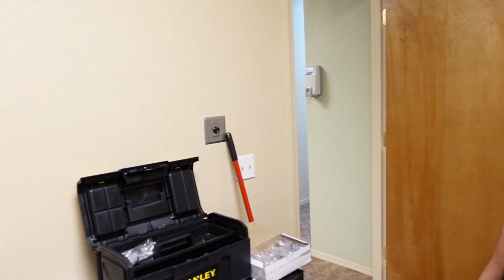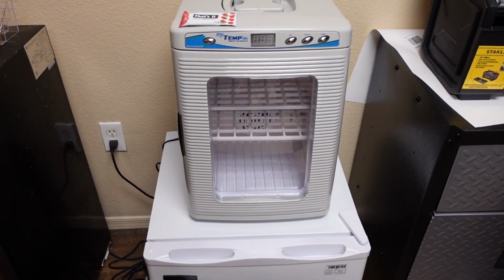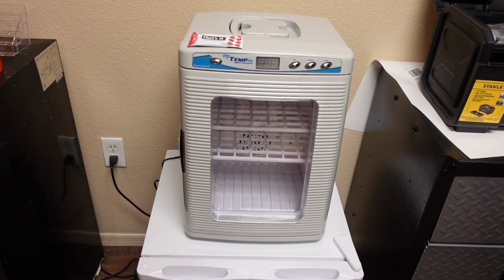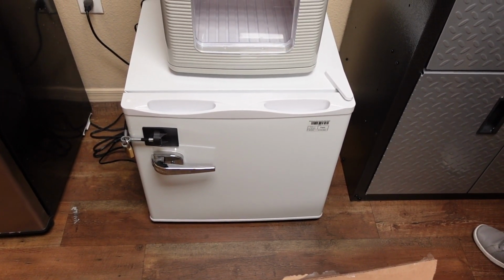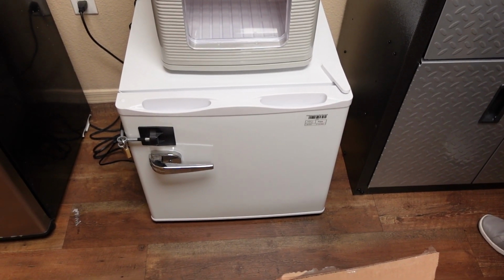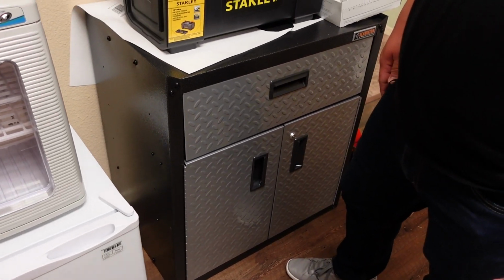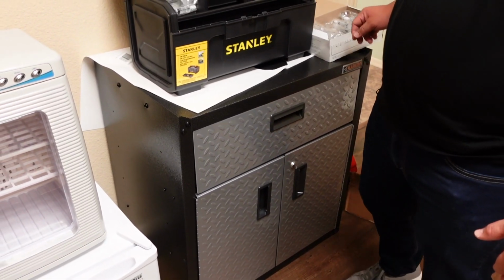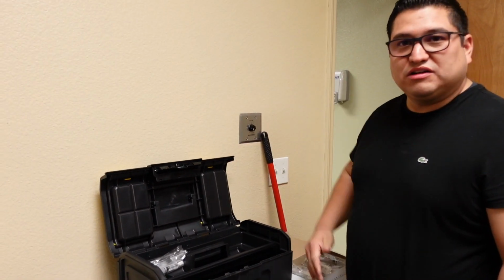The goal today is to set up the crash cart, and that's the famous incubator that we needed for this study. I got it calibrated, and then that's the refrigerator, if we ever have refrigerated IP, otherwise it's for PK samples. And that's our drug cabinet, and we're going to build another one of those, because they're about to send us a bunch of stuff. Probably just put them right on top of each other.